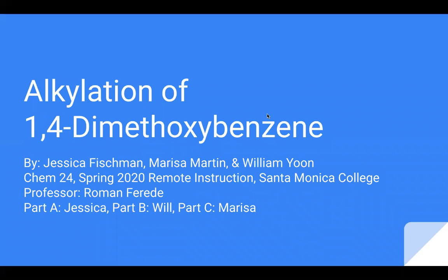Okay, so for this video, we will be talking about the alkylation of 1,4-dimethoxybenzene. I will be doing part A, will be doing part B, and Marissa will be doing part C.